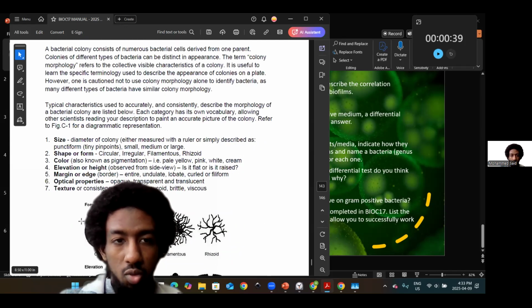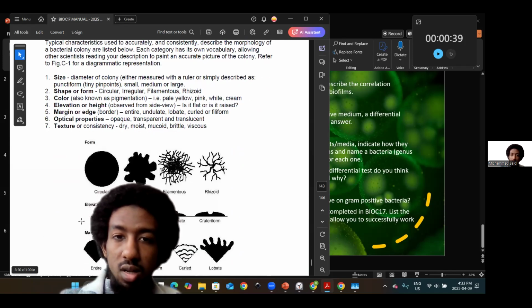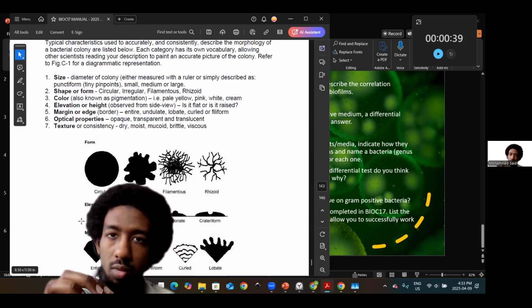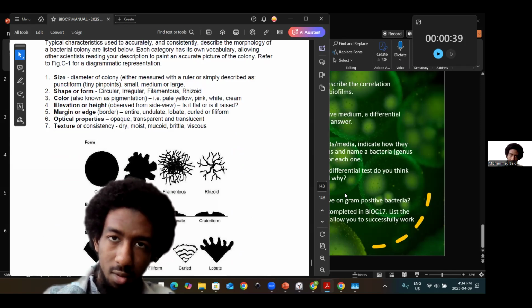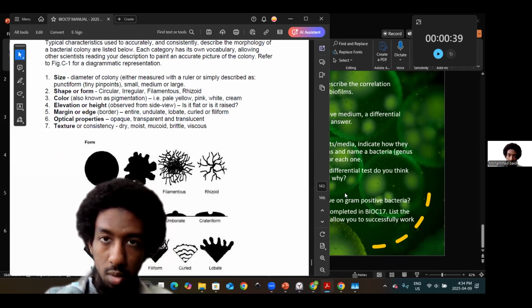And then describing morphology is also something to understand. The inhibitory effect, I didn't talk about this, but bacteriostatic versus bactericidal, to make it easier to understand. In your zone of inhibition, just understand this point for the antimicrobial susceptibility test. Post incubation, you have your discs and you have your zone of inhibition.